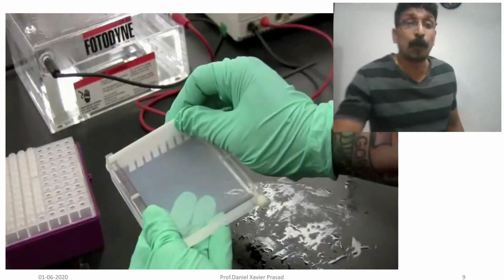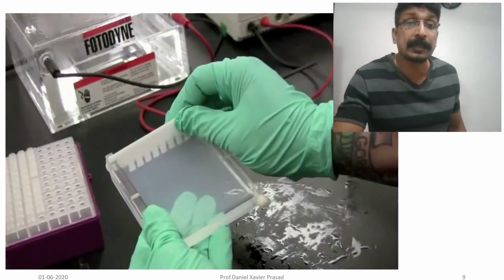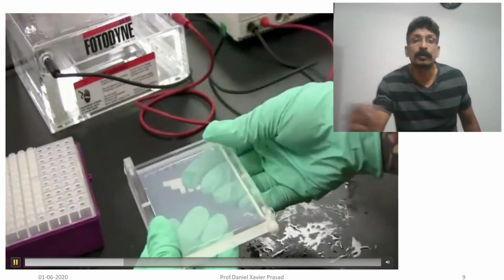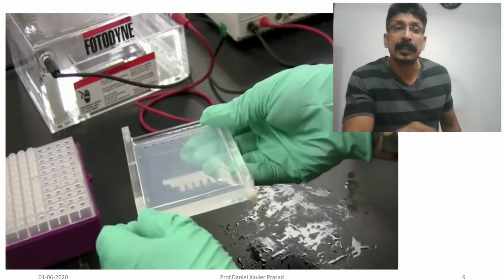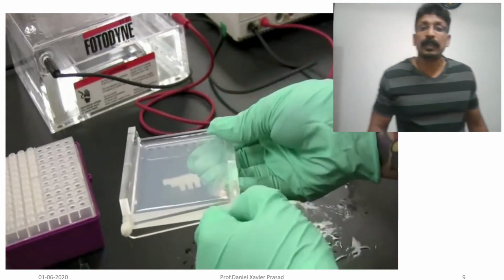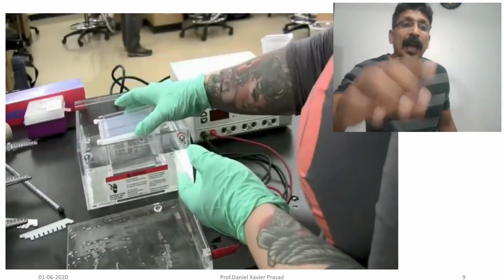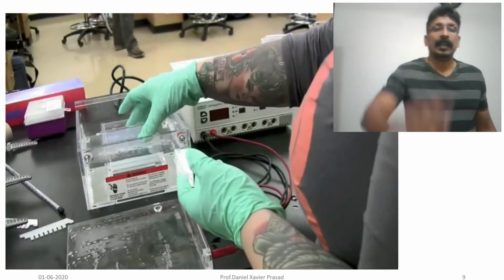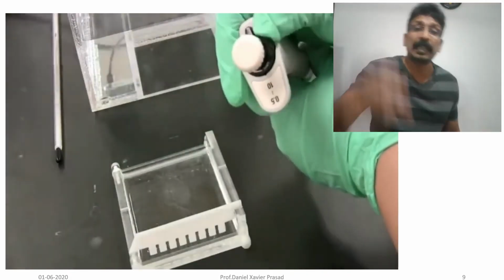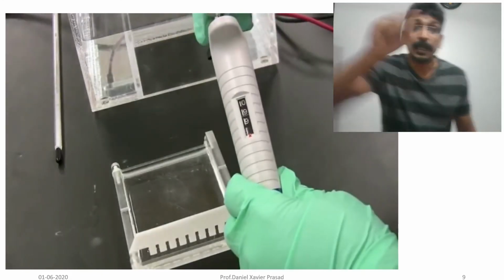If the video simply runs, you cannot understand. That's why I stopped here. Just watch. He removes the comb, and you can see the wells. There are two knobs: this is the negative side, and that is the positive side of the electrodes. He removed the plate and fixed it there. Before that, sampling should be done, an exact amount in the wells which I have shown.